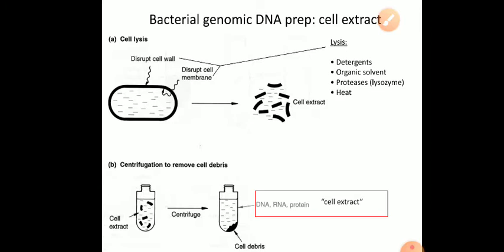So any chemical which can break the cell wall and cell membrane is to be added. So you have cells separated. Now to the cells you have to add cell lysing agents, chemical agents like EDTA, lysozyme, or any detergents like sodium lauryl sulfate, or depending upon your requirements, you can add various detergents.